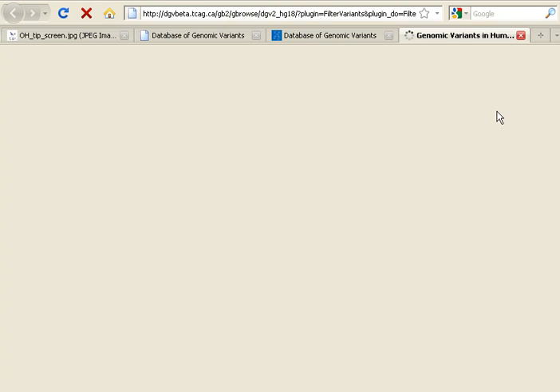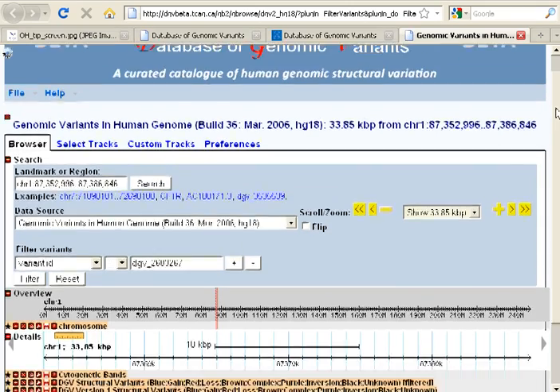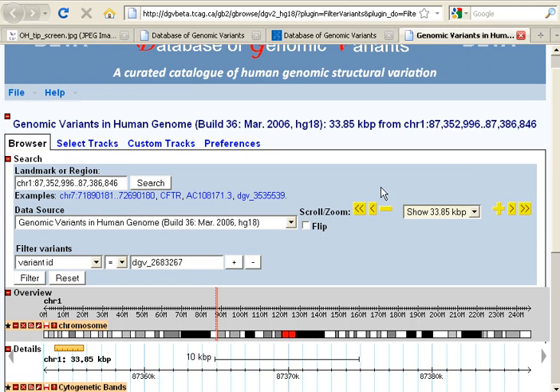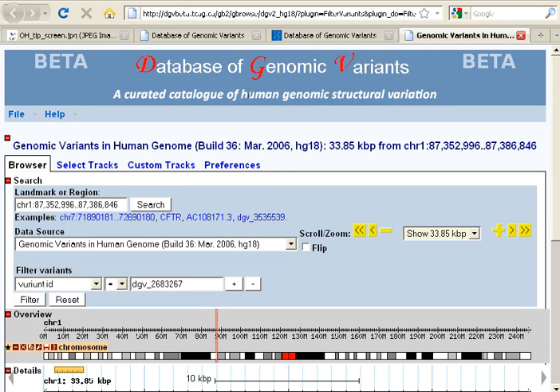That will take us over to the DGV genome browser. It's still based on GBrowse open source browser, as was the original browser. But now, not only do you get access to the browser, you also have tabs to select the tracks you want to view, or upload custom tracks, or set your preferences. So there are a lot of really nice changes coming with the DGV beta site.